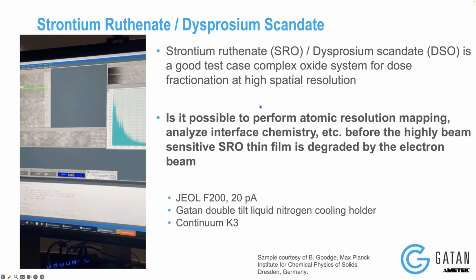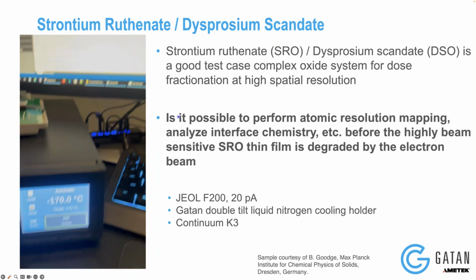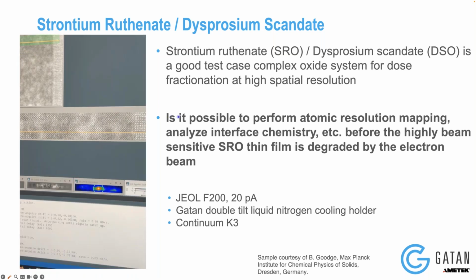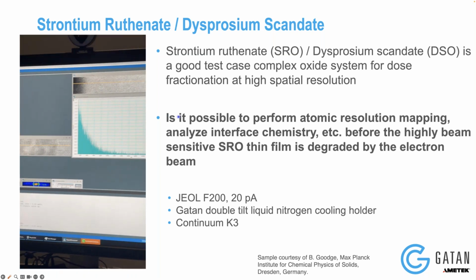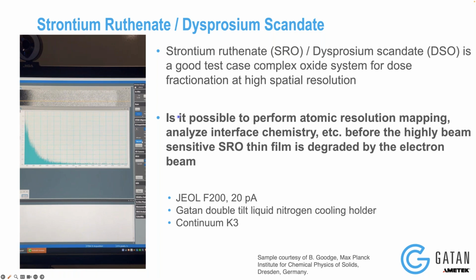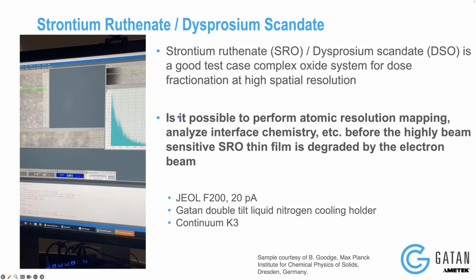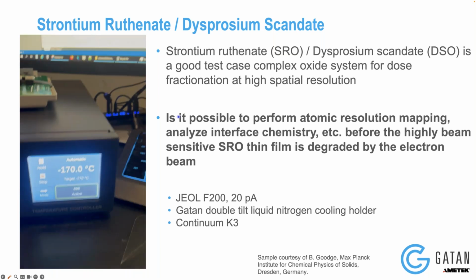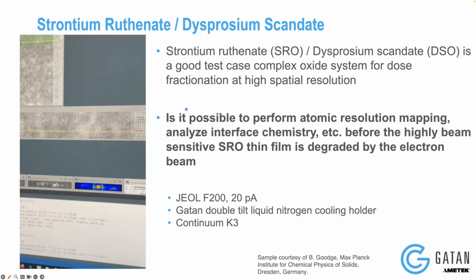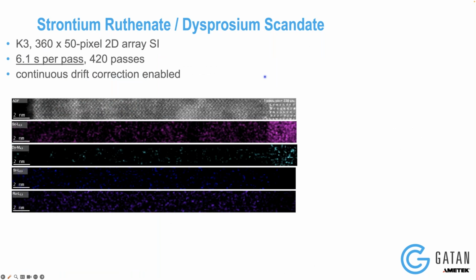If you look at the little video that's been looping on the left, if anyone hasn't figured it out already, this was me recording this experiment live when I was quite excited to see it working on the microscope. So that's the live experiment. We can clearly see atomic resolution in the single ADF frames, and that's at the temperature of the cryo holder. So let's take a look at the data. Okay, so first slide, we have just the single pass.